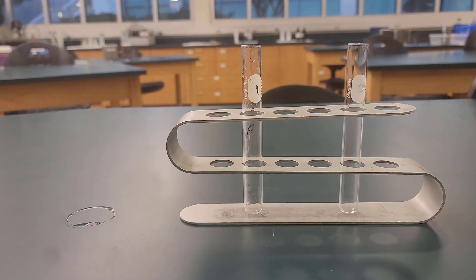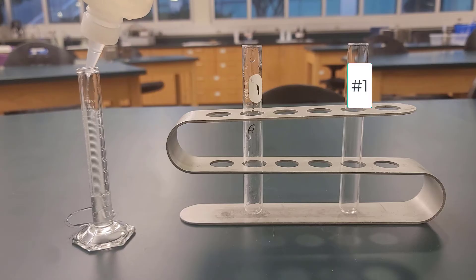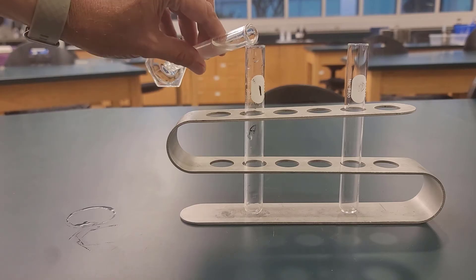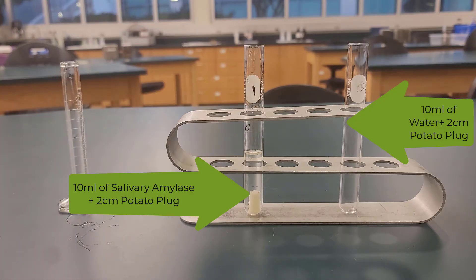So we're going to take, in test tube one, we're going to add 10 milliliters of deionized water and a two centimeter potato plug. And in test tube two, we're going to add 10 milliliters of salivary amylase and a two centimeter potato plug.